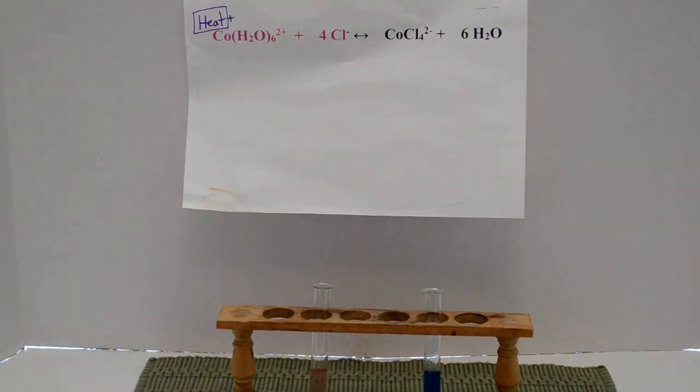Okay, little assistant, come here. What? Bring me that first container.